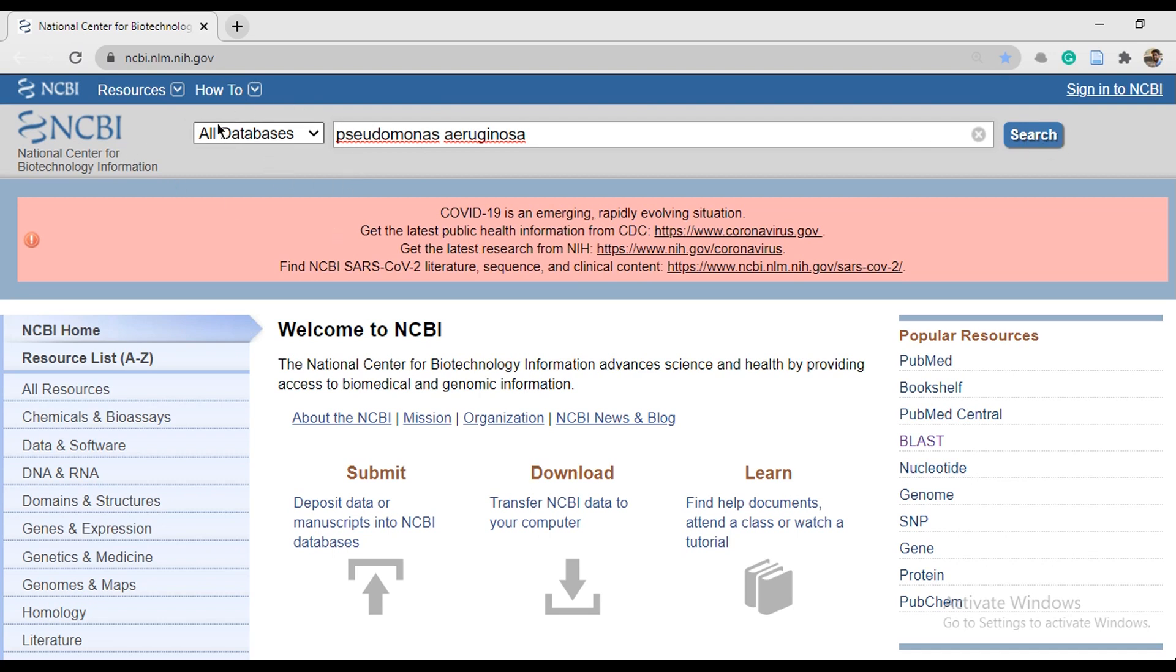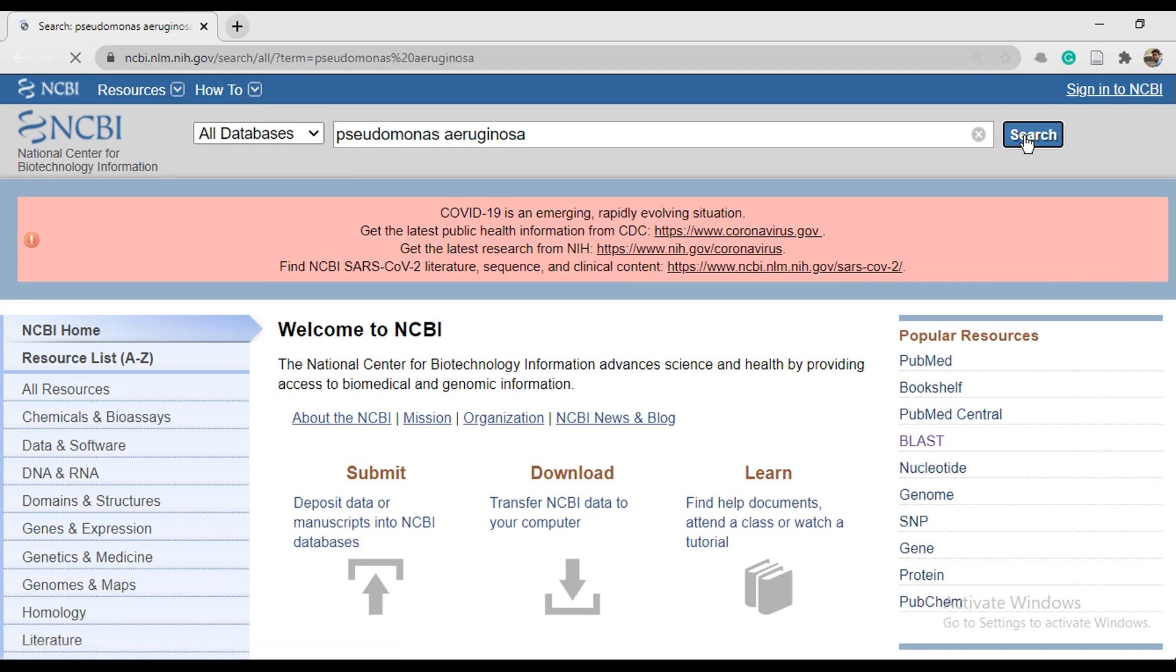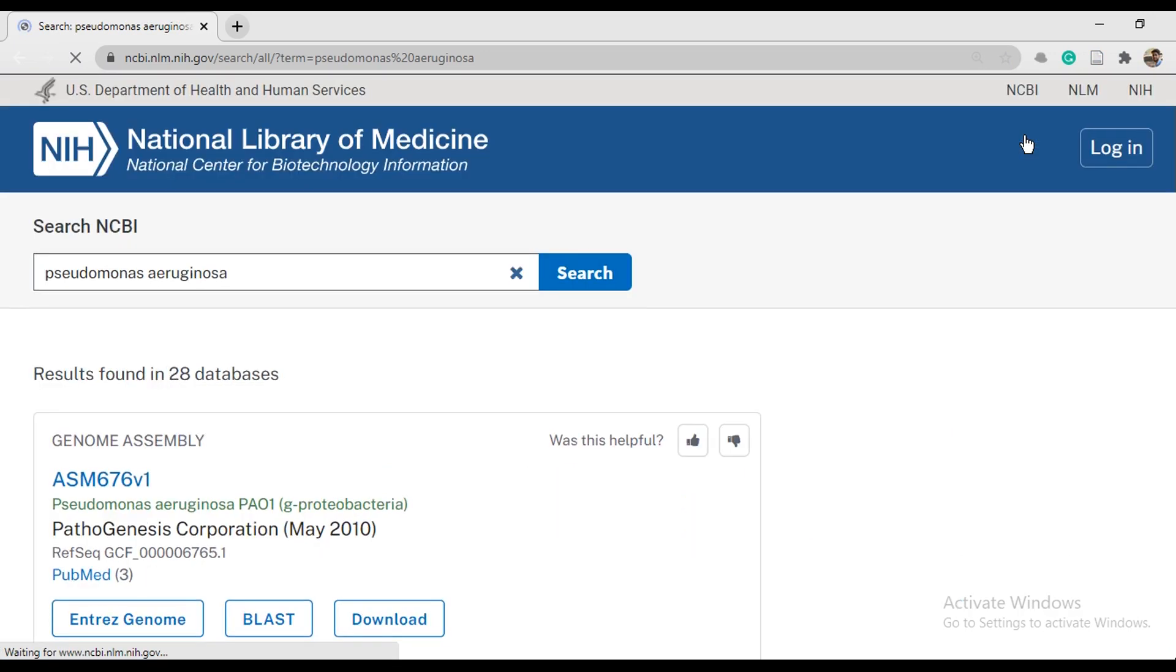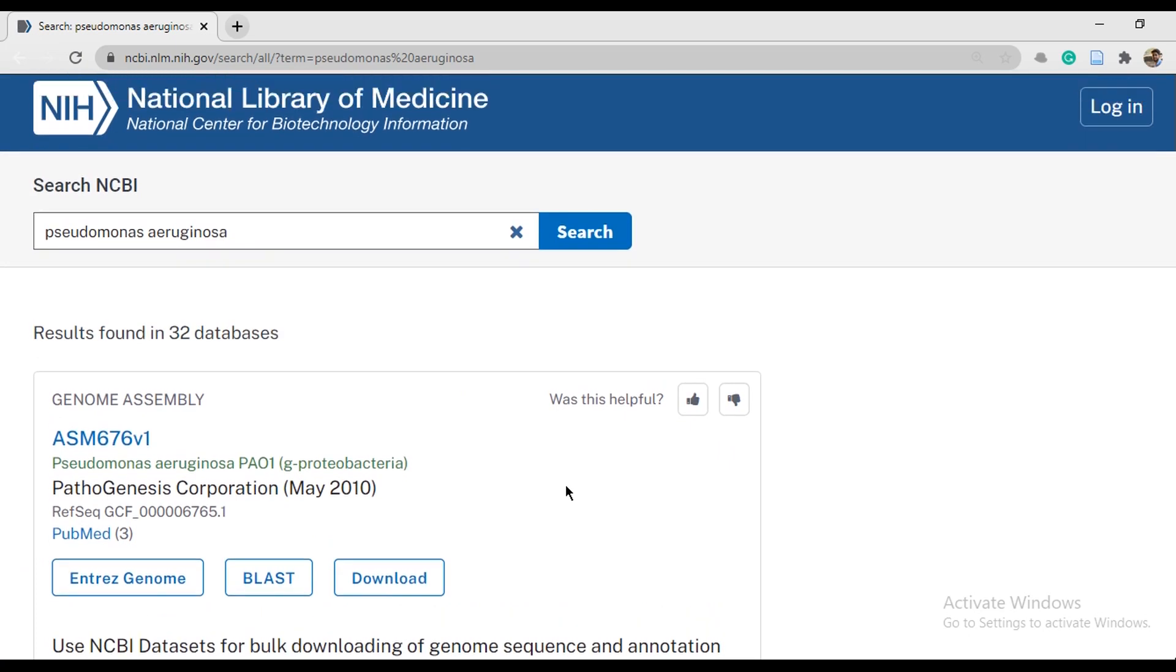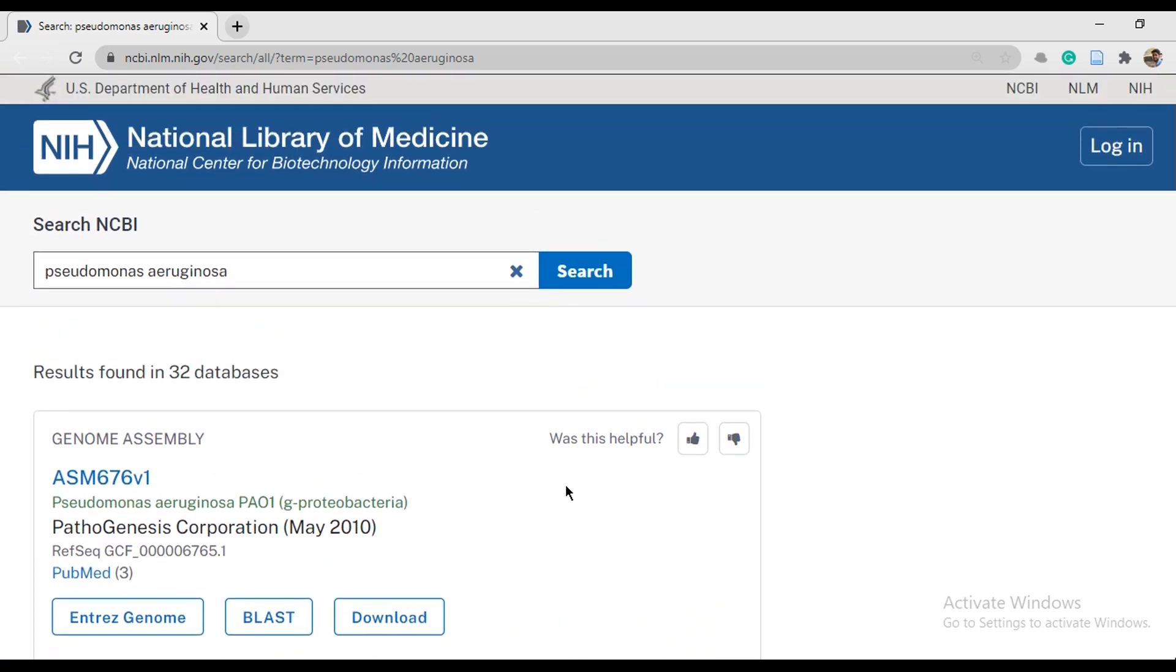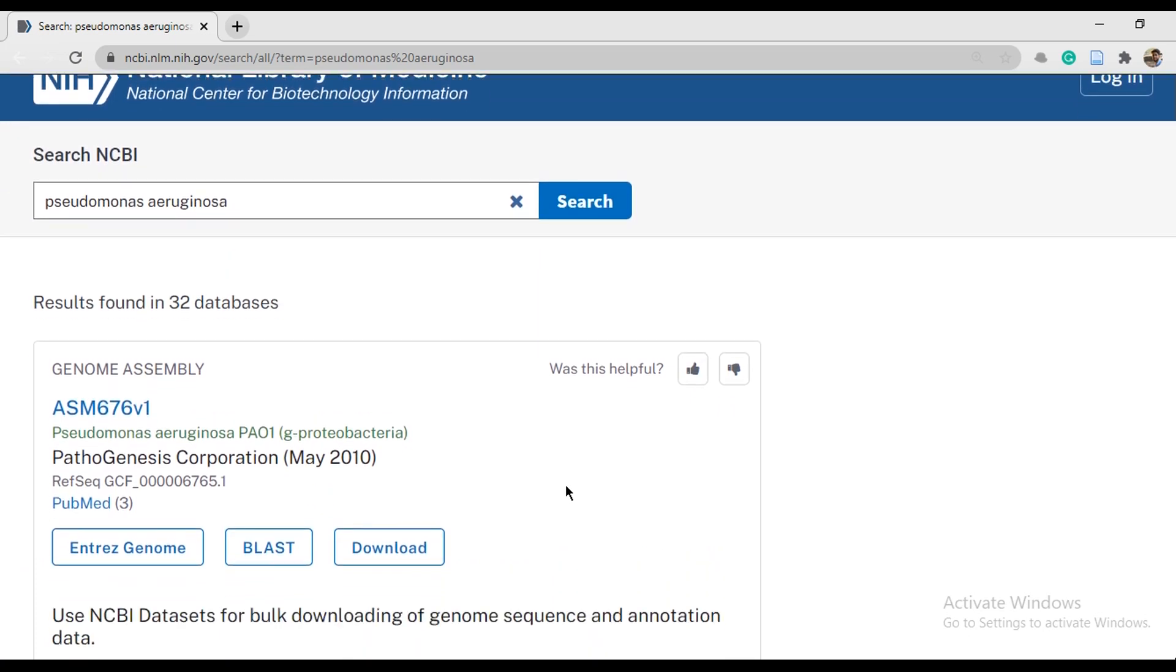In the next window, you have three options. You can click any one of them.